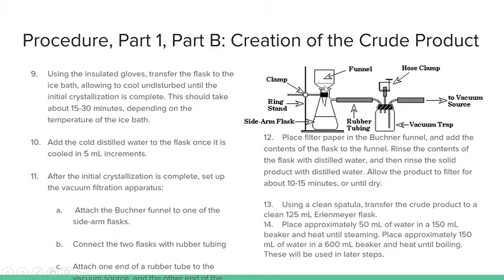However, we found that sometimes the ASA crystals are very small, and a lot of them would be filtered out with the water into the flask, and we'd lose a significant portion of the actual ASA crystals, which would contribute to a low yield in the end. And then we actually achieved a 30.45% yield, which is not ideal.